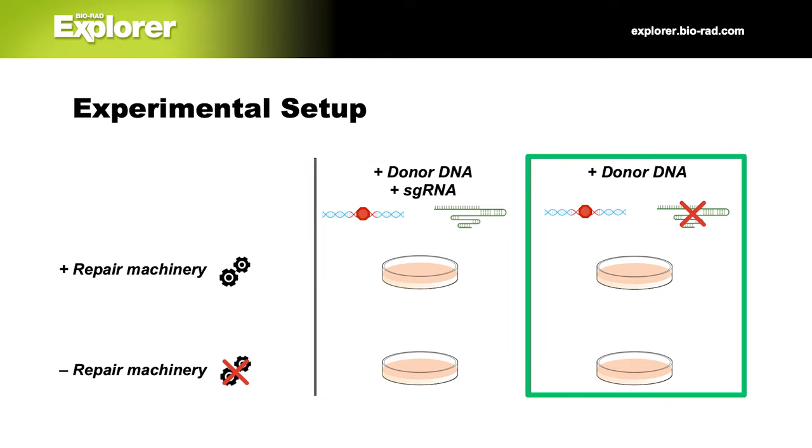Use a new loop and take 5 more colonies off this plate and add them to your D tube. Swirl the loop around to disperse the bacteria into the transformation solution and put the tube back on ice when you're done.